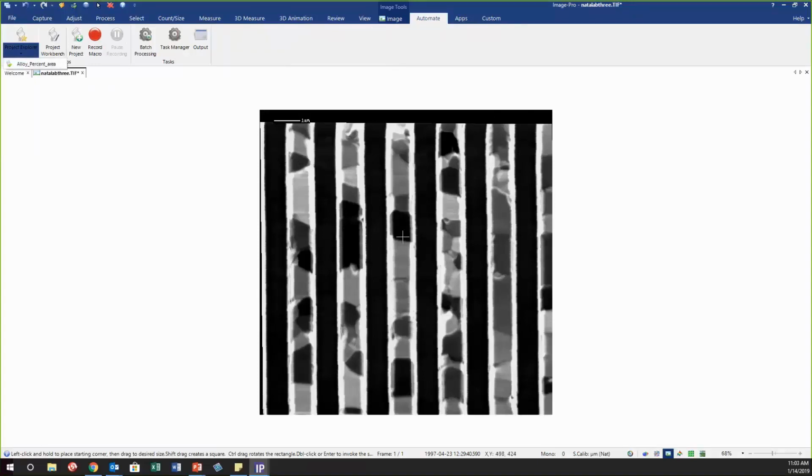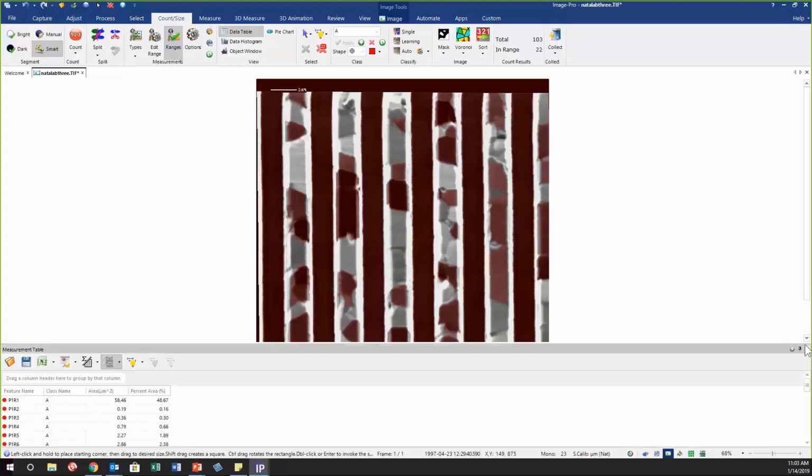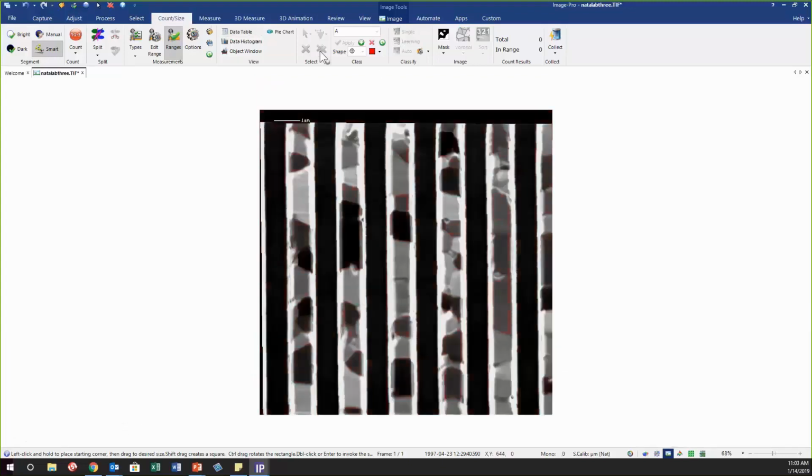through these structures, and this is the EM image, you can see the calibration bar there, but it's simply to measure an alloy within it. The problem in this particular one is that what I'm trying to measure matches the background. So normally to overcome this, we either position a series of ROIs and use Features Manager, or you can prompt someone to draw them. Again, depending upon the workflow and what needs to be done, but we want to add some interactivity to prompt them either to reposition ROIs or to draw ROIs so they're not counting the background.